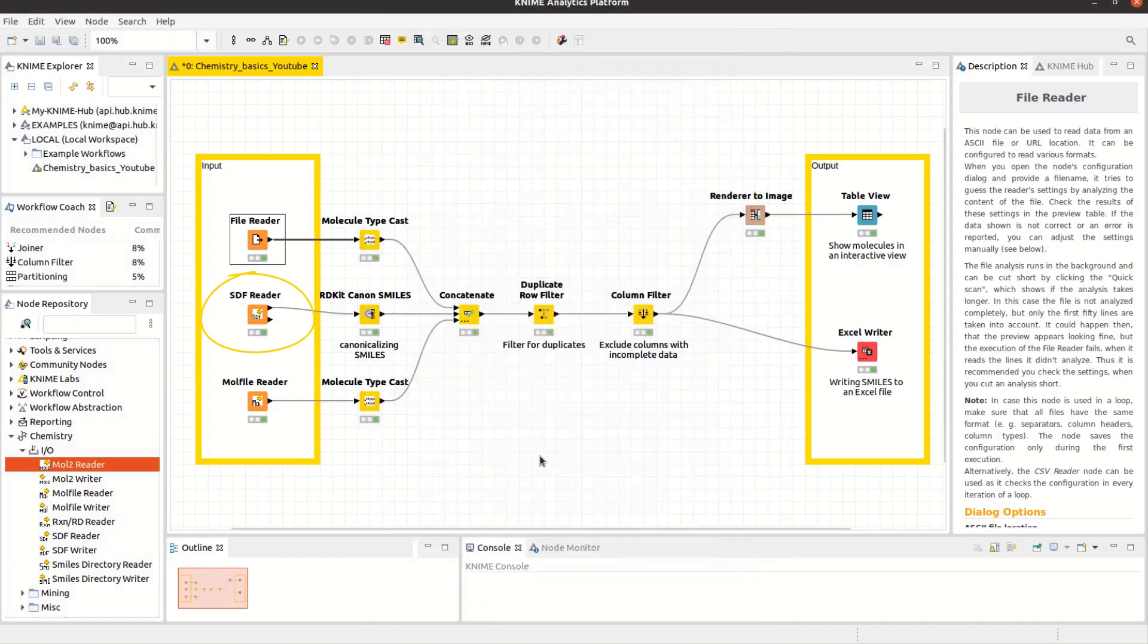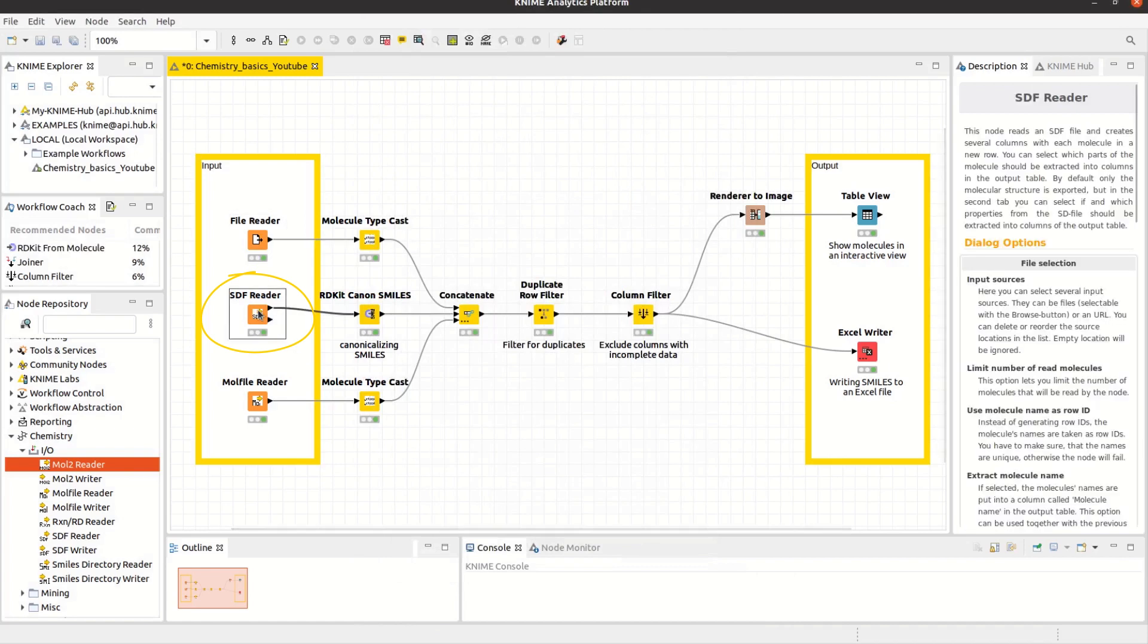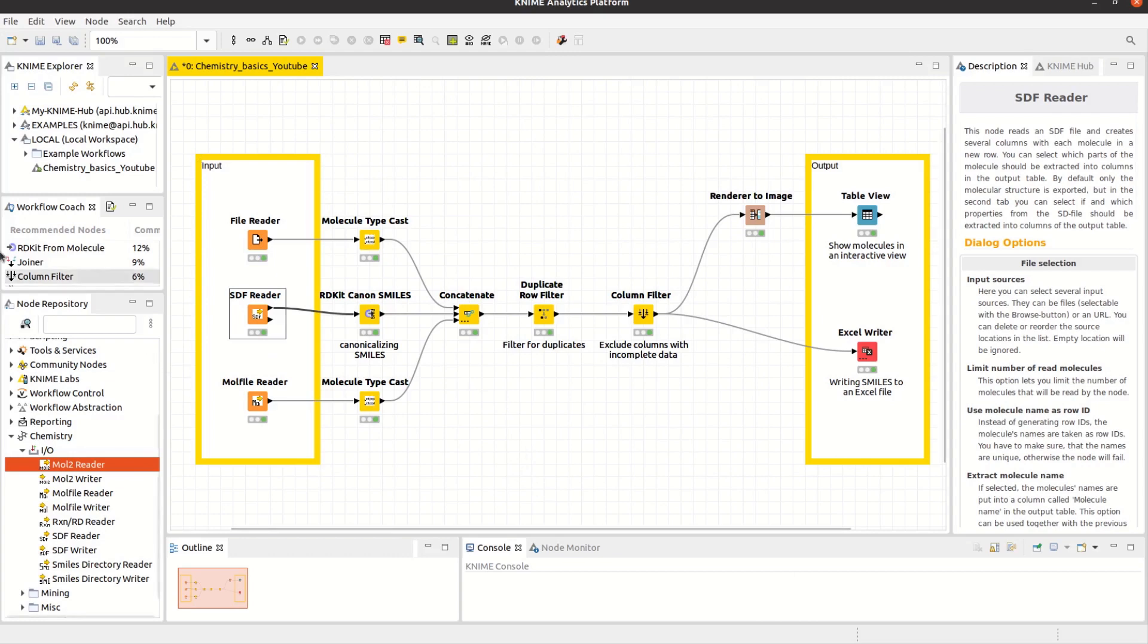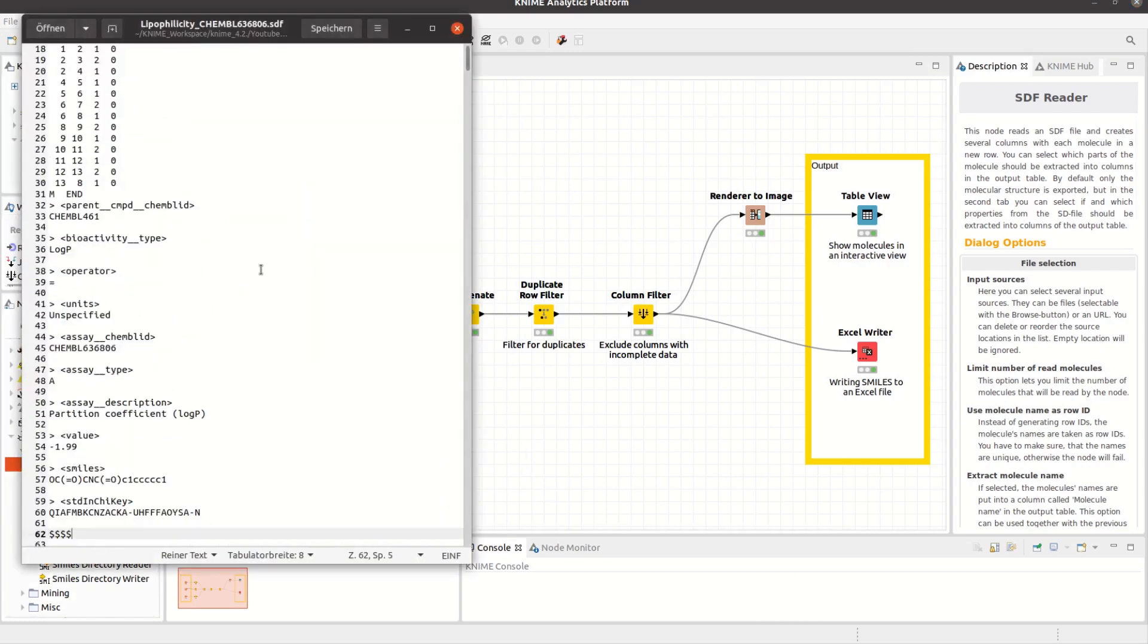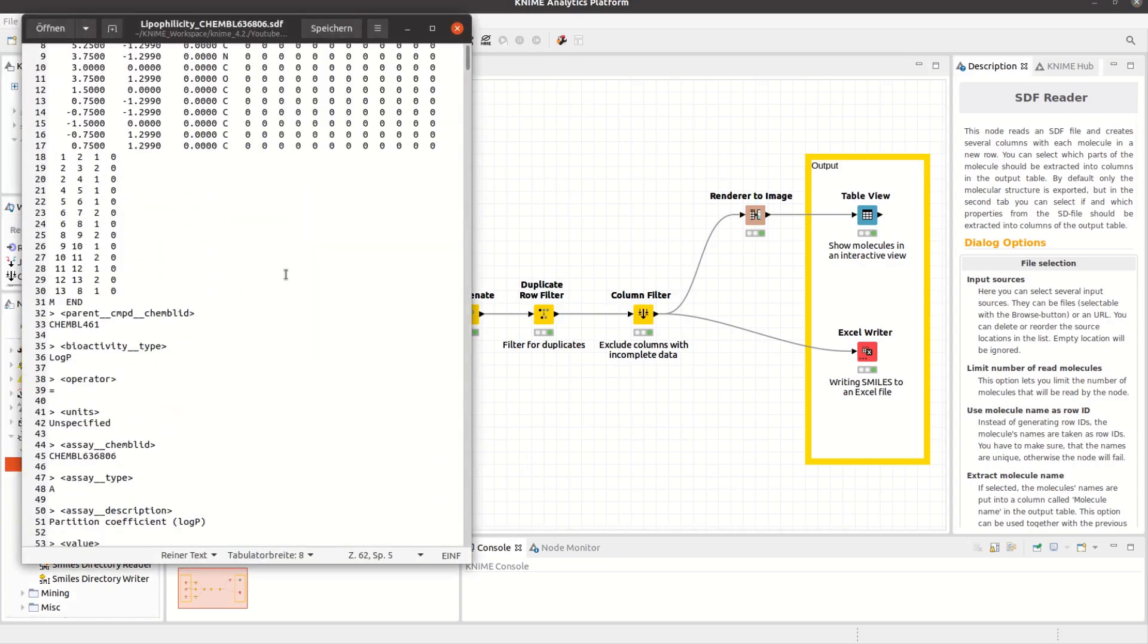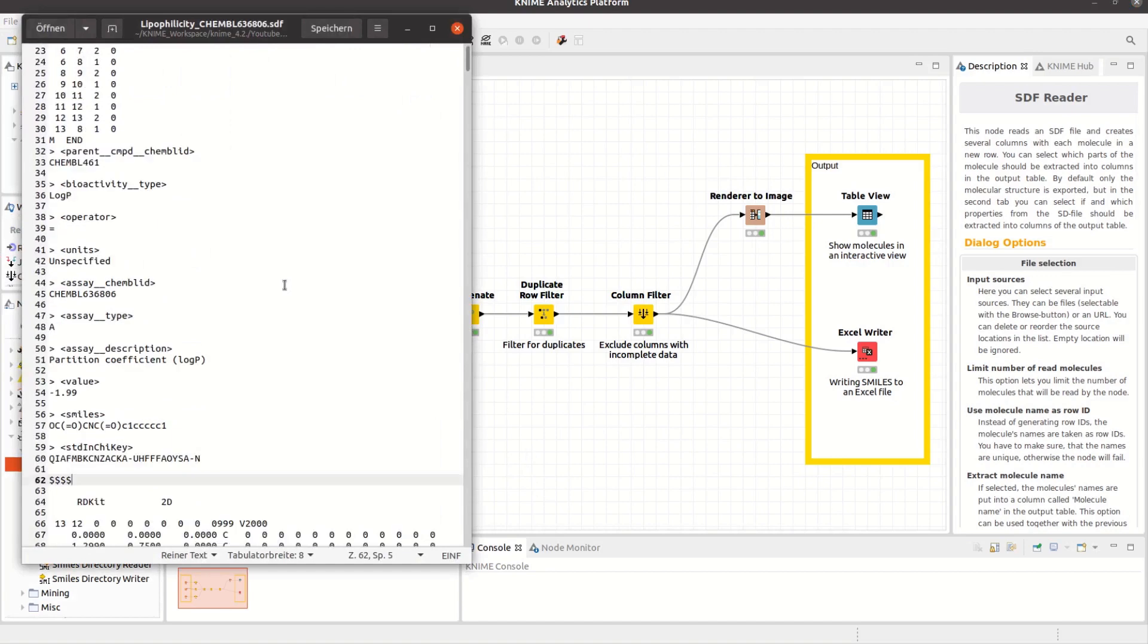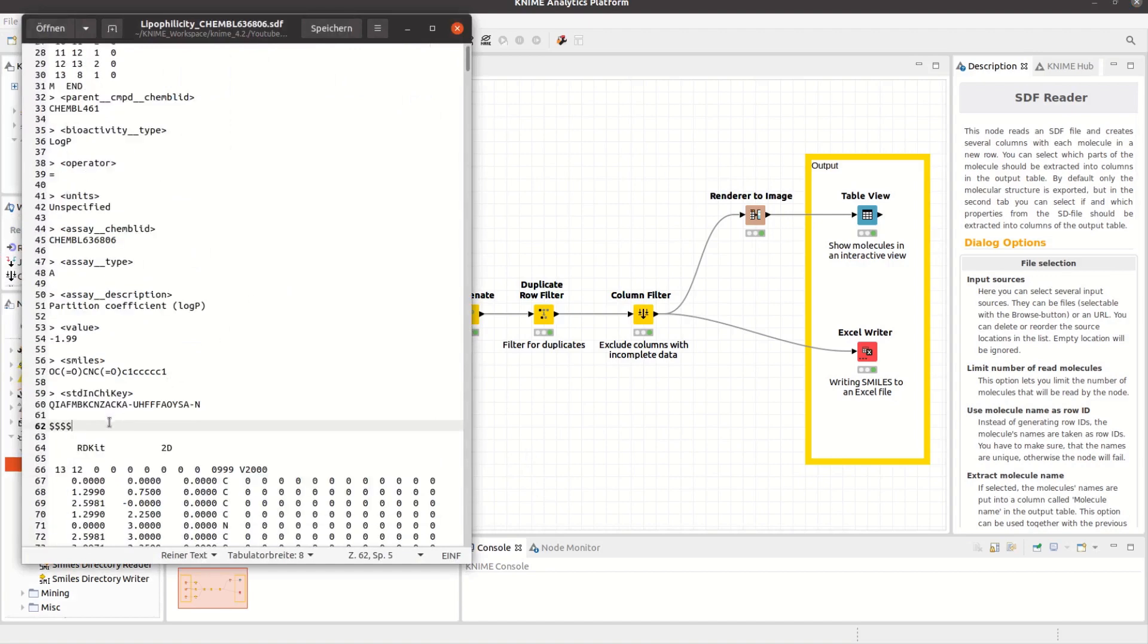The SDF reader reads an SDF file and creates several columns with each molecule in a new row. SDF stands for Structure Data File, in which multiple compounds are delimited by lines consisting of four dollar signs.